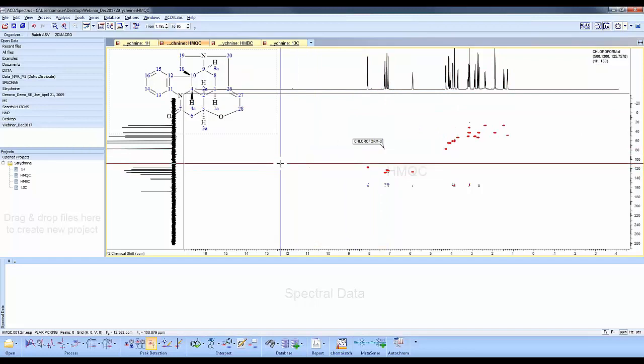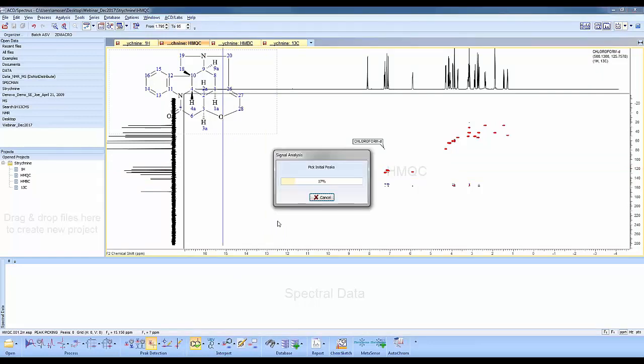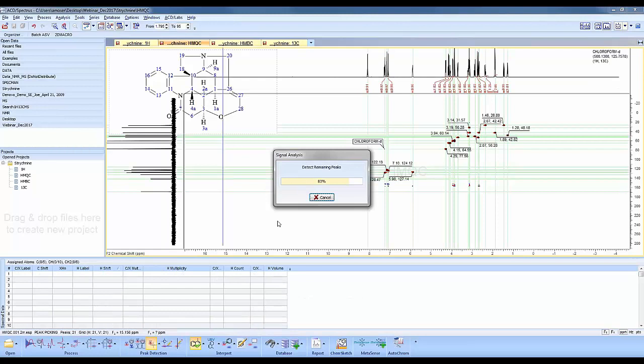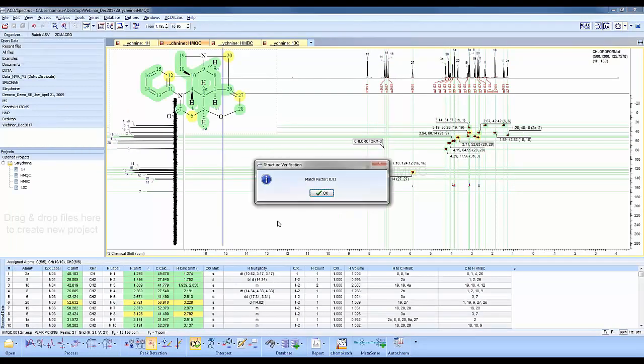When your data is loaded, you can click Auto Assignment, which is this green check mark here. This will peak pick, integrate, multiplet analysis, peak pick across all the experiments, and report back a match factor.